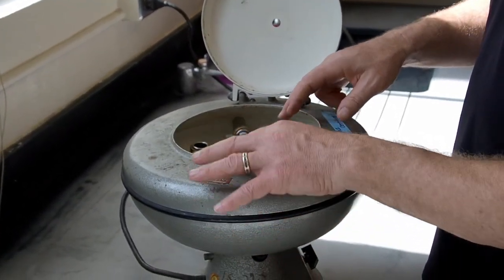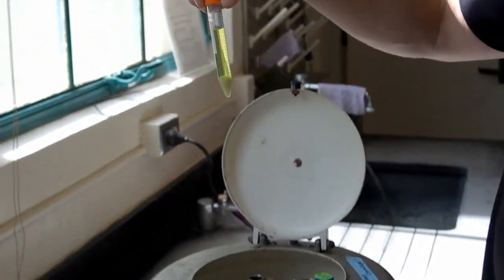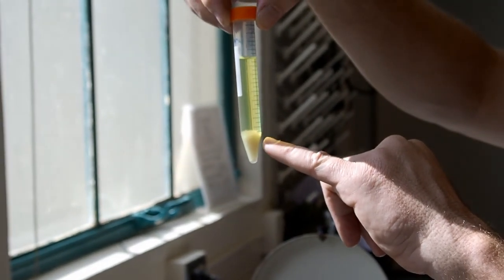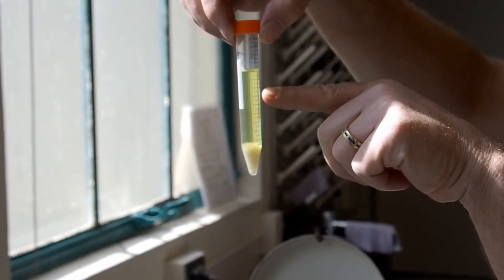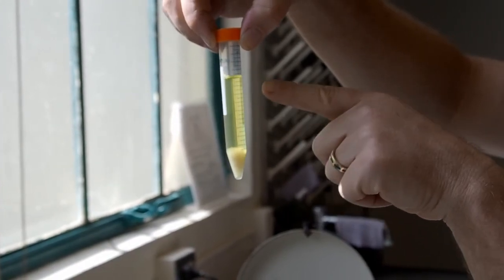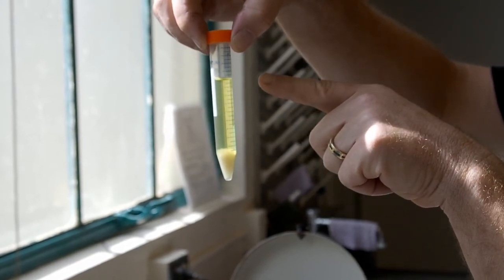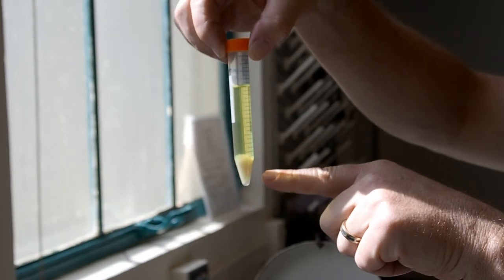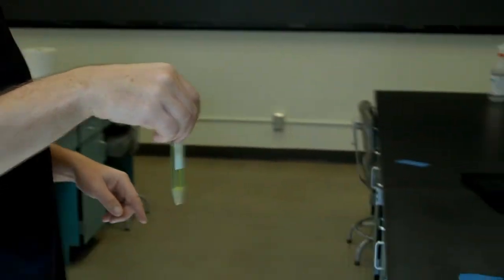Got our samples here. And here's the sample we've been working with. You can see all the solid material down at the bottom of the tube, and all the green liquid containing chlorophyll at the top of the tube, the supernatant. Our goal was to use the supernatant in our spectrophotometer to read the absorption of wavelengths of light in this sample. That's why we had to centrifuge this to get all the material down to the bottom. So let's bring this on over to our spectrophotometer.